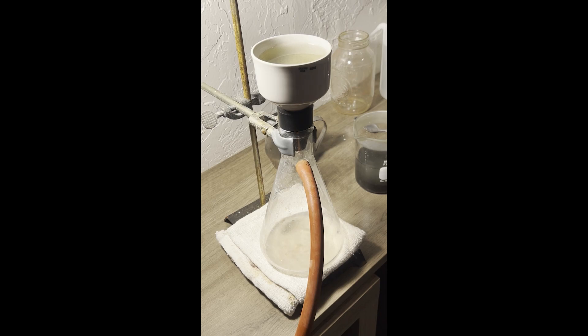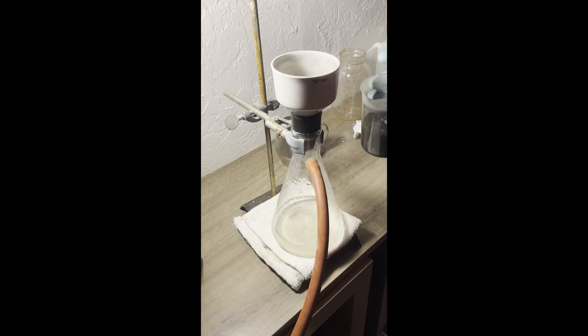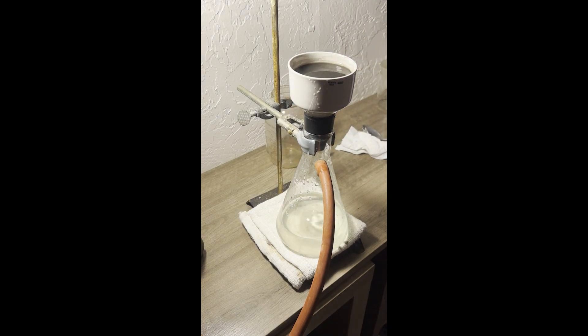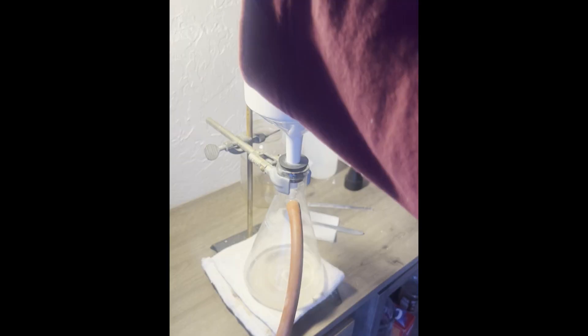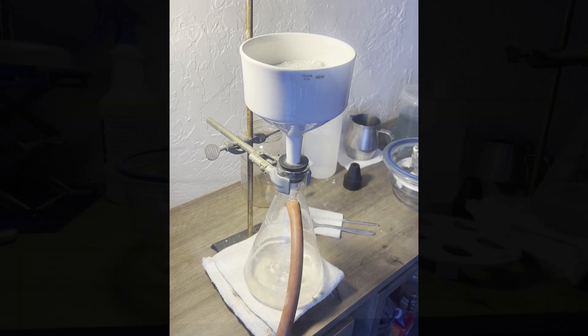Back to filtering the insoluble material. The filtrate is a very pale green, so there was some remaining ferrous sulfate. Stuck to the magnetic stir bar is cast iron that didn't dissolve. Then I filter the cooled alcohol and ferrous sulfate mixture, crush and move the powder to a container, put it in my desiccator with a dish of sulfuric acid above it, and connect it to my vacuum aspirator pump.